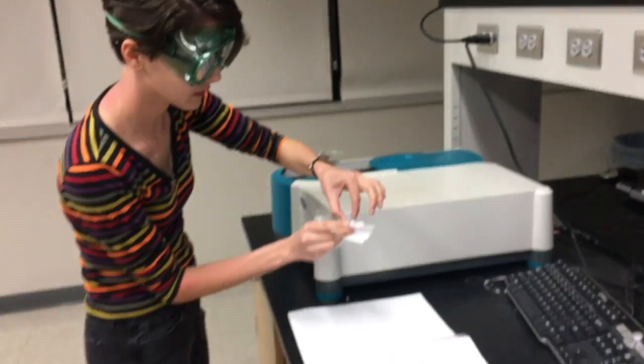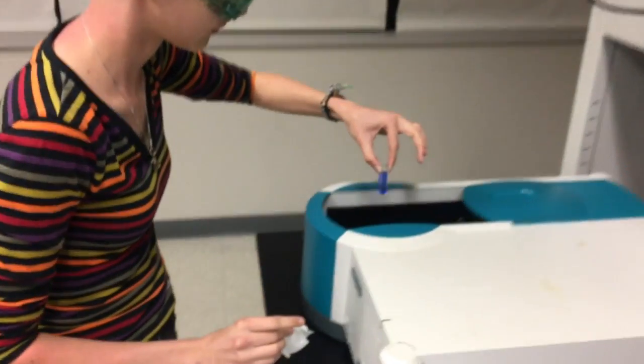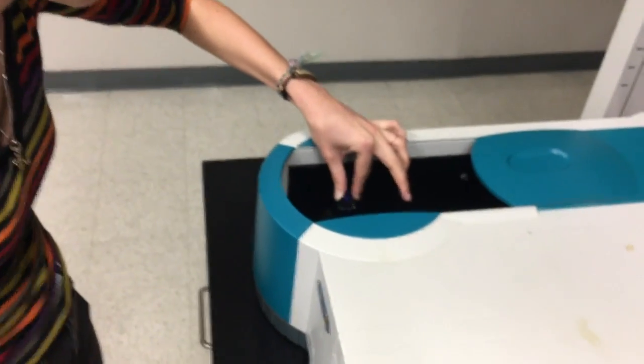Before putting a sample in, it is important to clean it with a Kim wipe on both sides, the sides that the light beam is going to shoot through.